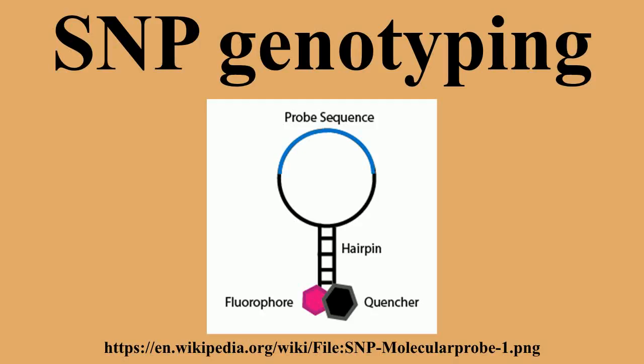If the allele-specific probe matches the target DNA, it will fully hybridize to the target DNA and ligation can occur. Ligation does not generally occur in the presence of a mismatched 3' base. Ligated or unligated products can be detected by gel electrophoresis, MALDI-TOF mass spectrometry, or by capillary electrophoresis for large-scale applications, with appropriate sequences and tags on the oligonucleotides.